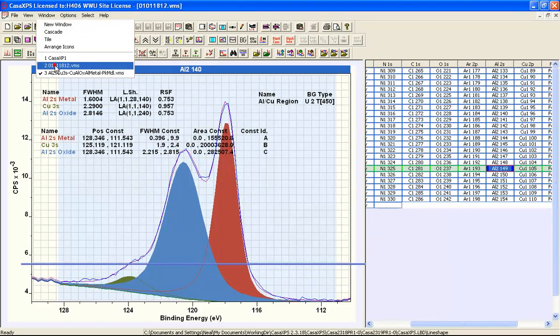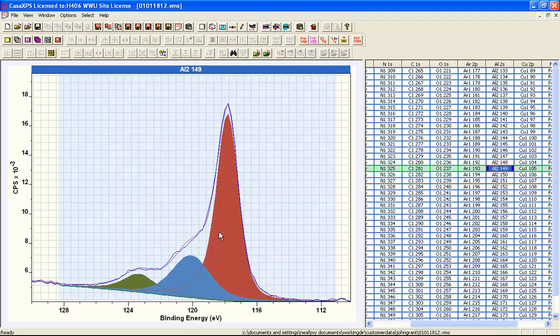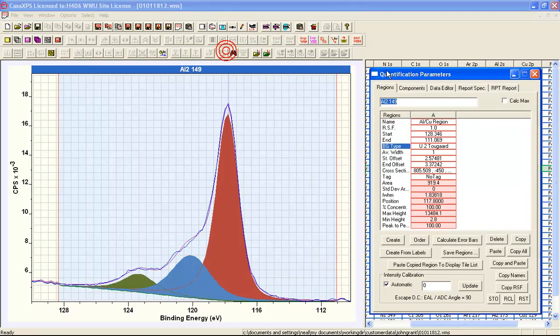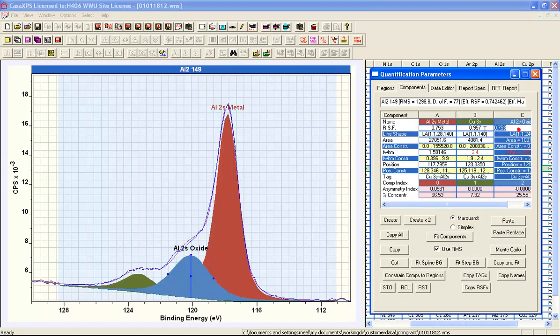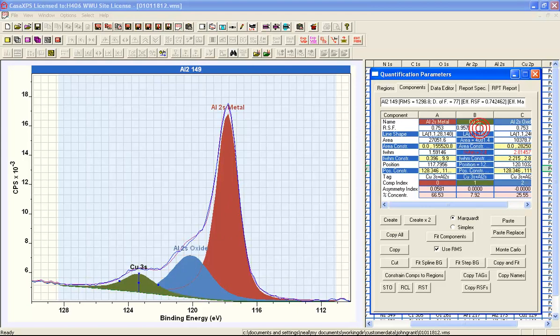Going back to the depth profile, we now have a peak model fitted to these data. The peak model includes a region and three components. The relative sensitivity factors are set to be the same for the metal and the oxide, with a different sensitivity factor for the copper 3s. As a consequence of fitting these peaks to the data envelope and using these relative sensitivity factors, an effective RSF is calculated so that if we include a region covering this interval and use the effective RSF to scale the data, other lines with their own elemental RSFs will return the correct atomic concentration.